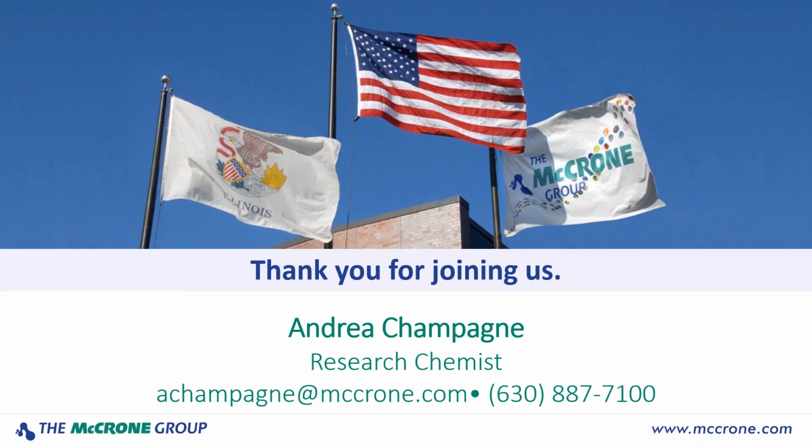Another one from Laura. Is there an advantage to using colored sampling devices to aid in differentiation between the sample and the sampling device? Color can help. What we tend to use more to really make a particle stand out are different lighting conditions.